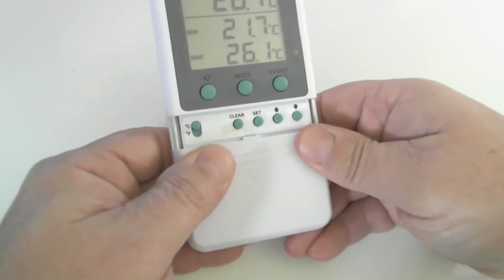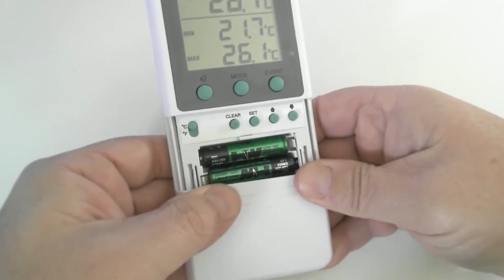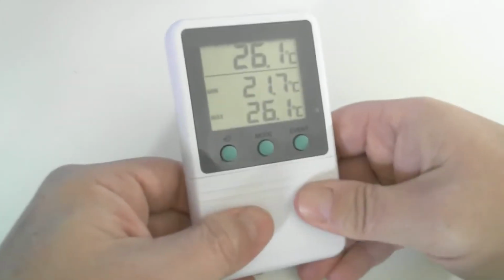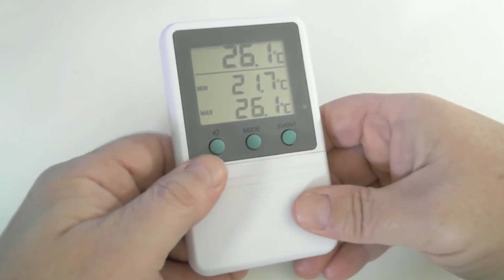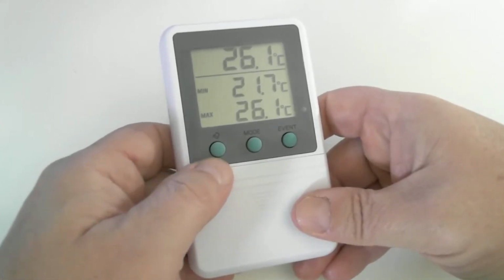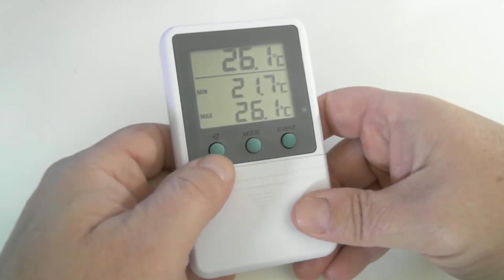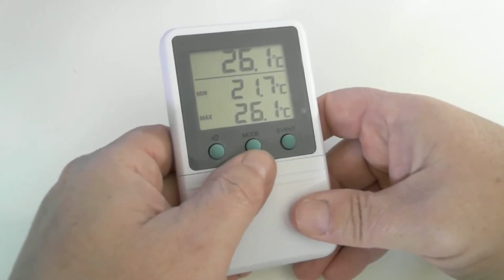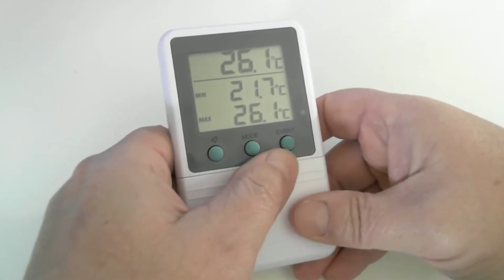Sliding the cover further will expose the battery compartment. All right, let's close that up. Now, on the front of the unit, we have 3 additional buttons. On the far left, we have the alarm deactivation button, has a little bell over the top. In the center, we have a mode button for scrolling through the different display screens. And to the far right is the event button to see additional information for each display mode.